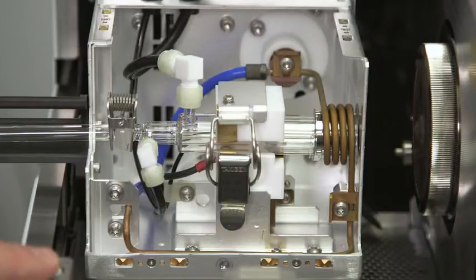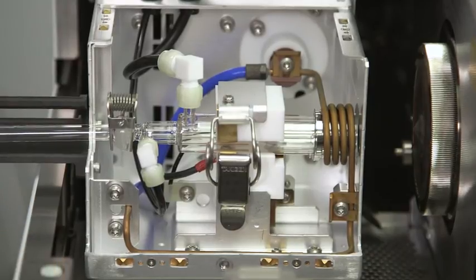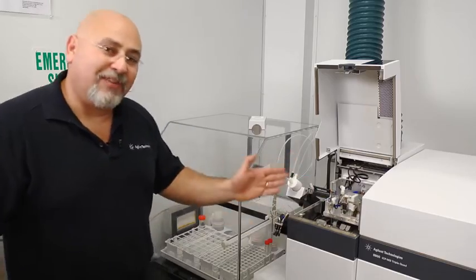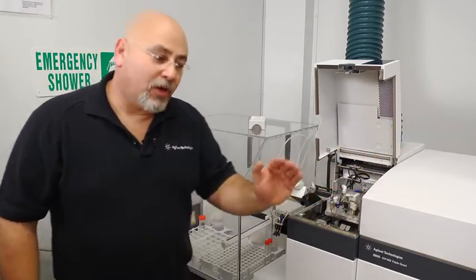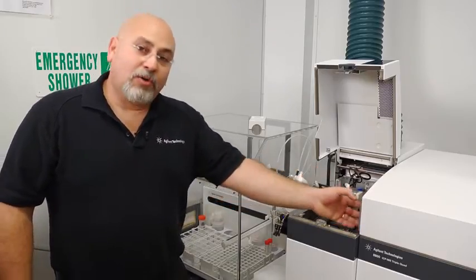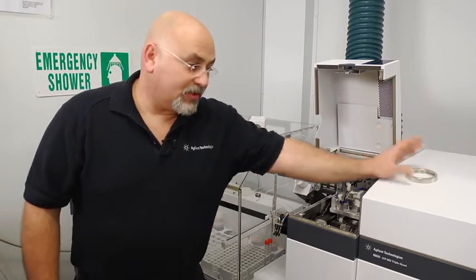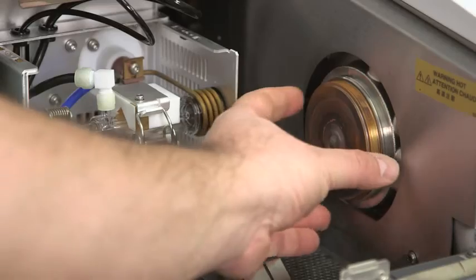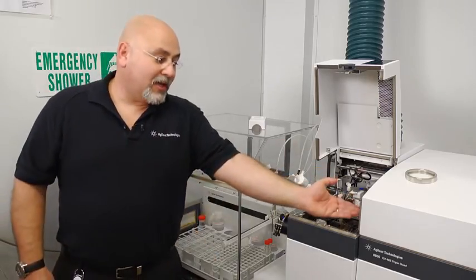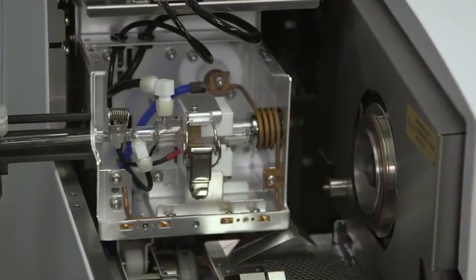We're going to push this little button right here to allow the entire sample introduction to move back so we can access the cones and the lenses, both of which are outside the high vacuum, so you never have to break vacuum in order to access cones or lenses. The sampling cone is held simply by a retainer ring, which is hand mounted, and then the cone literally comes out in one piece. What you can see back here is basically the skimmer cone, which is mounted onto the lens base.